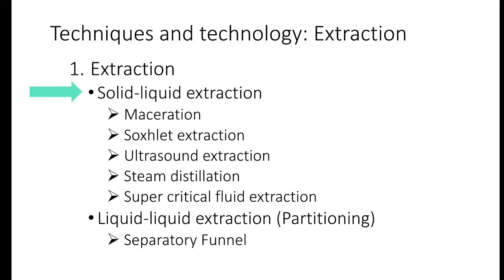So let's go first to maceration. This is the easiest one. Pag sinabing macerate, all you have to do is to soak the solid in the solvent. This could take more or less 48 hours of maceration to maximize extraction.